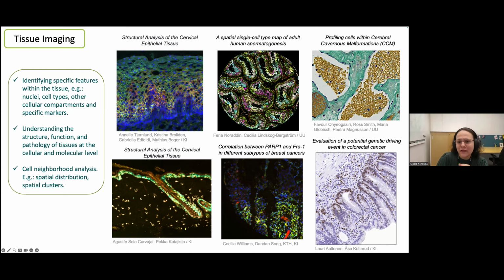But you can also think about multiplexed imaging. So new technologies now allow us to track a large number of proteins for the same sample. That's what we call highly multiplexed imaging, for instance. And we also have stained tissue as well, very commonly used in clinical practice.